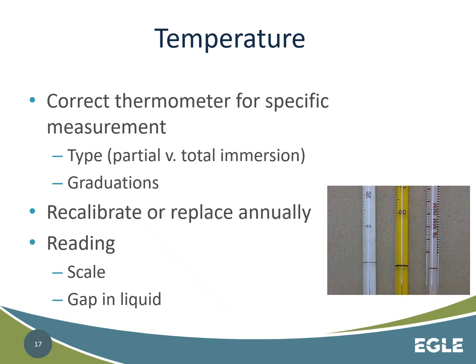So, temperature. We need to be using calibrated thermometers to ensure that the thermometer on the outside of an autoclave or on the outside of an incubator is completely accurate. Thermometers within an incubator, you're going to typically have 2 of them. They're going to be submerged. All right, and we'll talk about total immersion ones versus partial. The reason for that is the immersion thermometers hold temperature a lot better when these incubators are opened and closed. They don't have an immediate drop in heat because of being opened or closed, theoretically speaking. So the 2 types that we have are the partial and total immersion.